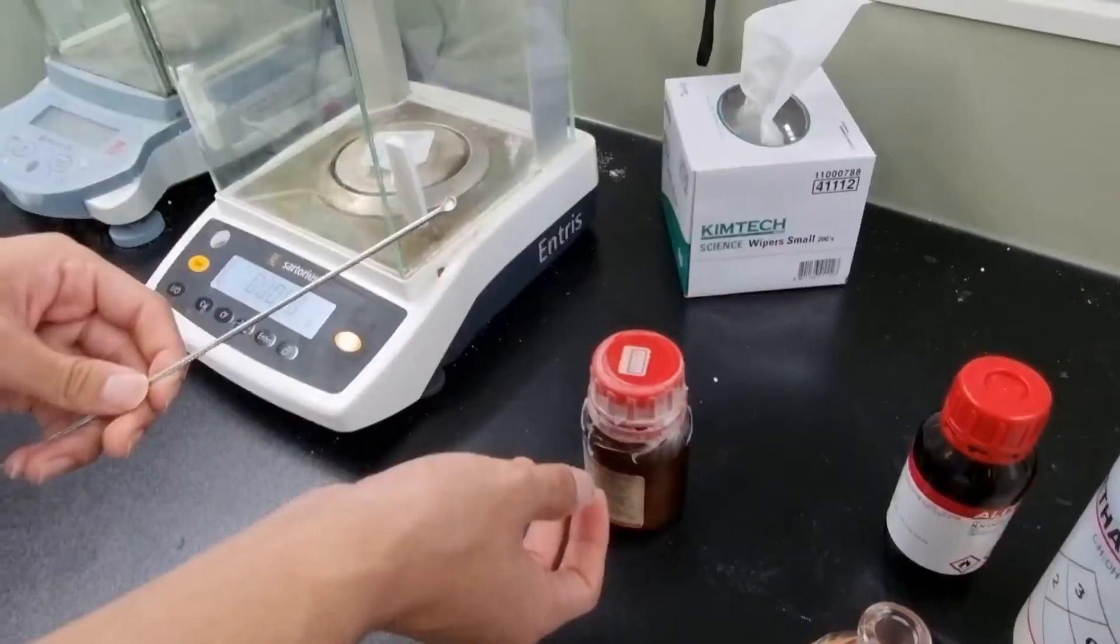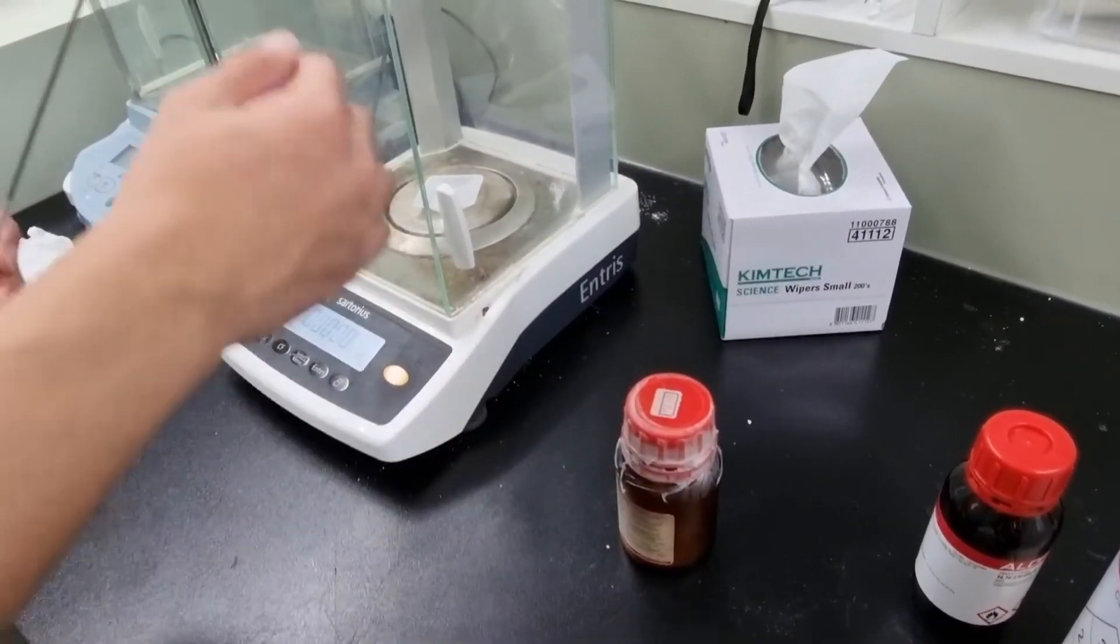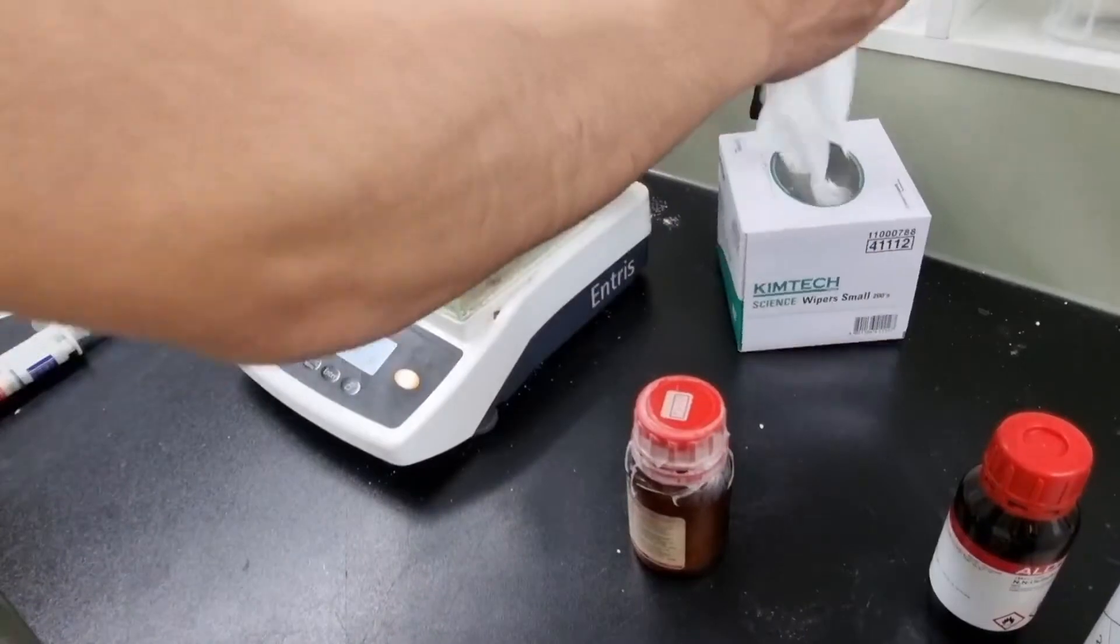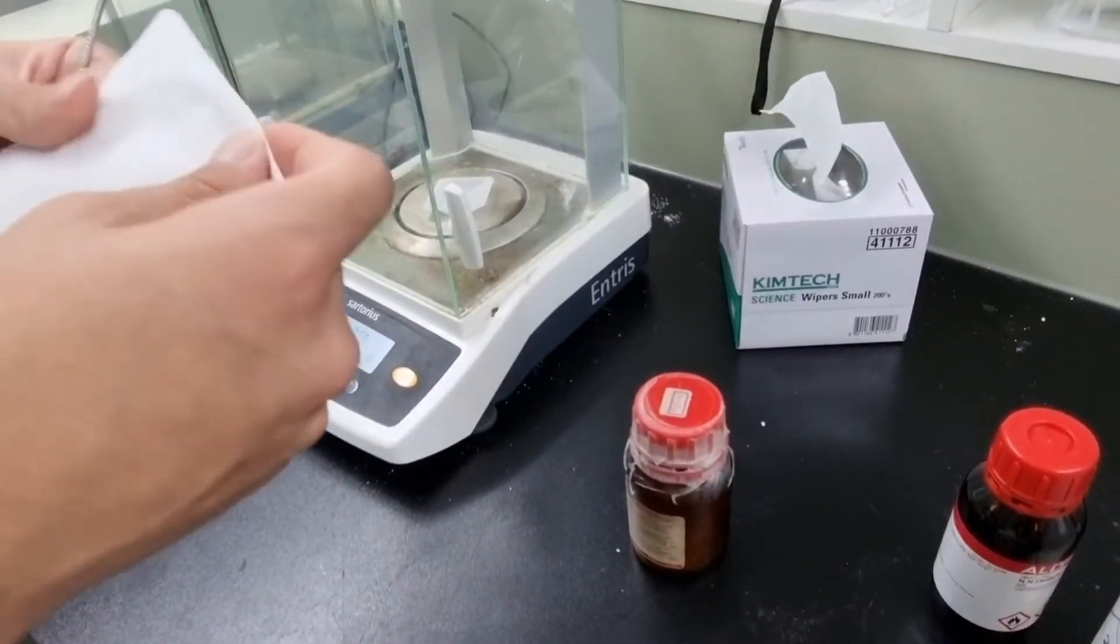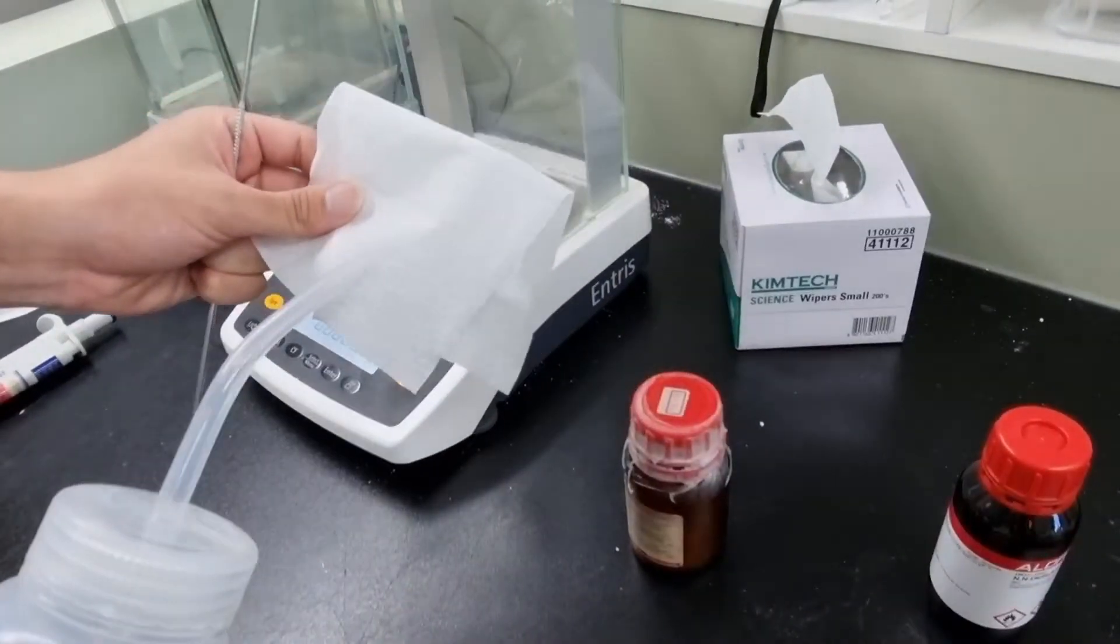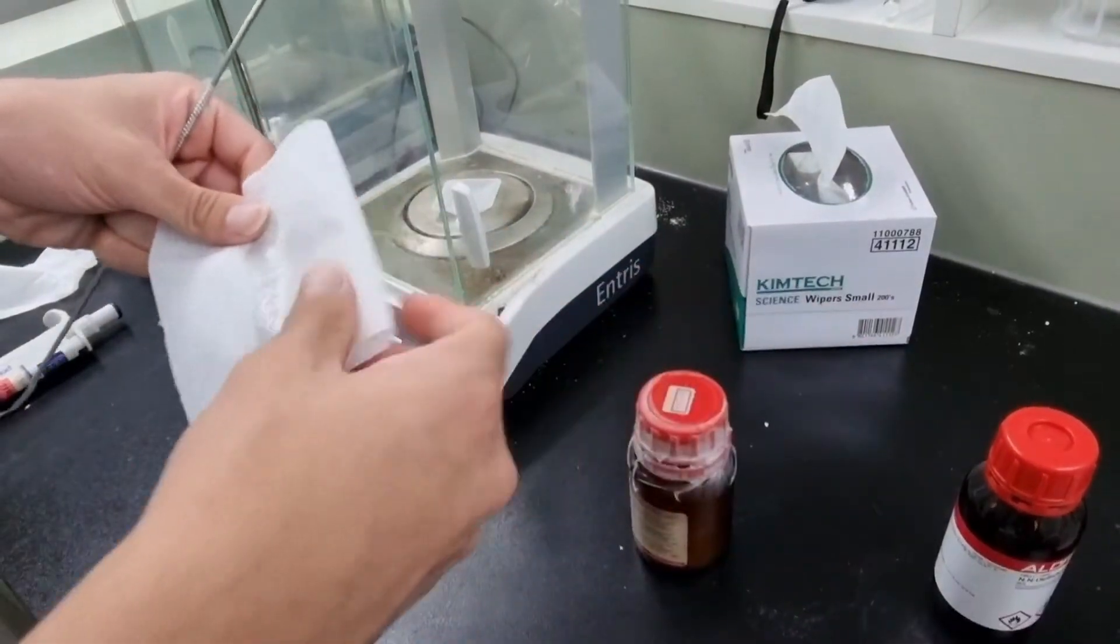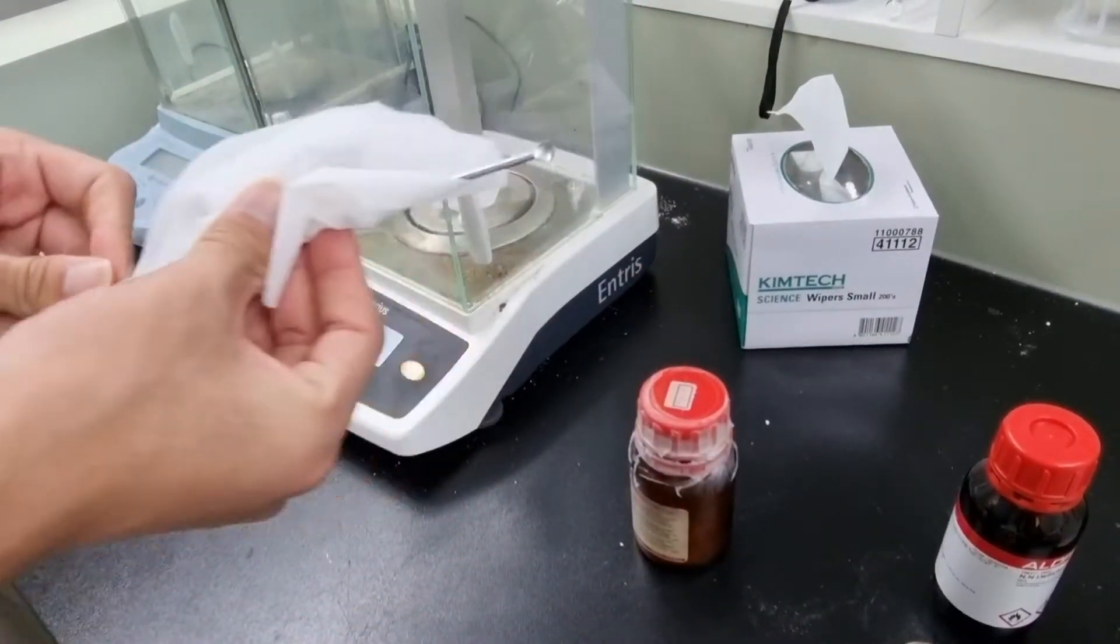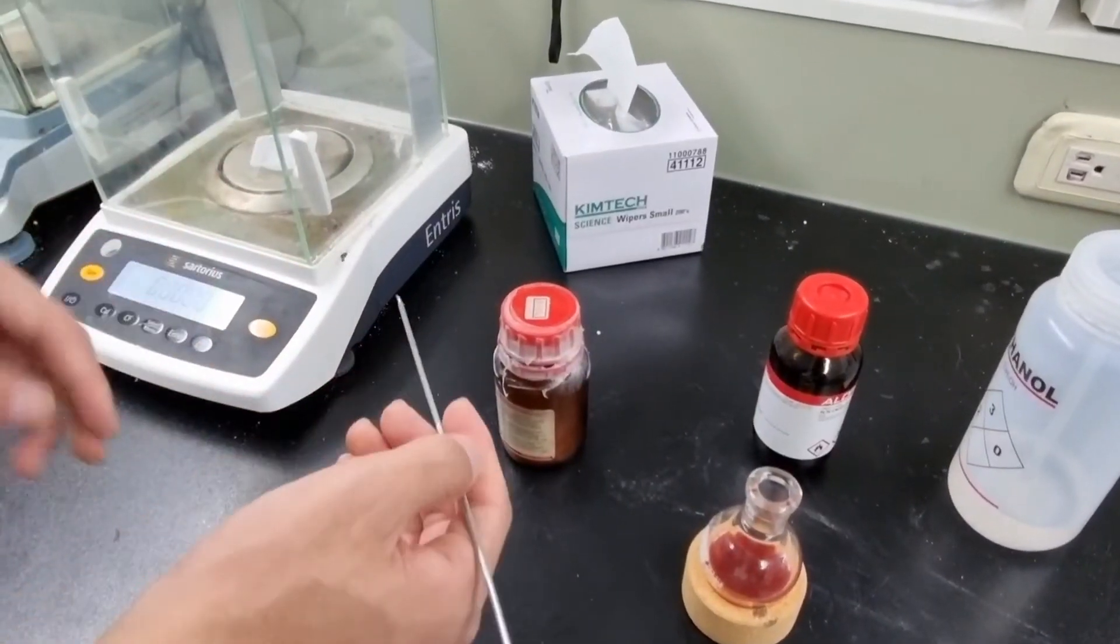So we use the spatula to scrape off the powder and put it on the weighing dish. But before that, you need to first sanitize the spatula with ethanol. After we clean this end of the spatula, we put the metal salt.